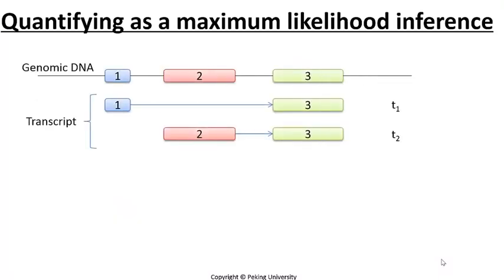In principle, the expression level of transcripts can be inferred directly from the expression level of exons once the transcript assembly is done correctly and the expression levels of these exons have been correctly normalized, as described in the previous unit. For example, assume that we can infer from the three exons on the genome the two transcripts T1 and T2. Meanwhile, assume that the normalized expression level of each exon can be determined: E1 equals 20, E2 equals 40, and E3 equals 60.